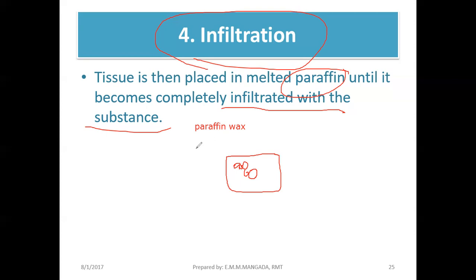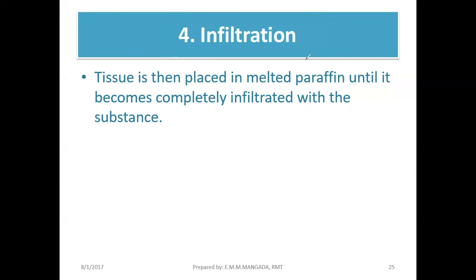So imagine, 'pag kinat mo yung frozen na pork, madali yung mag-cut at madali para sa'yo na makapag-produce ng cubes or cuts na ang shape ay cubes, 'di ba? Unlike pagka hindi siya frozen, ang hirap mag-cut kasi magalaw yung karne. Ganon din yung sa infiltration and impregnation natin. That's to make the tissue firm to facilitate the cutting later of our tissue. So ano ba yung cutting na sinasabi ko? Mamaya, tignan natin pagdating natin dun sa process na yon.